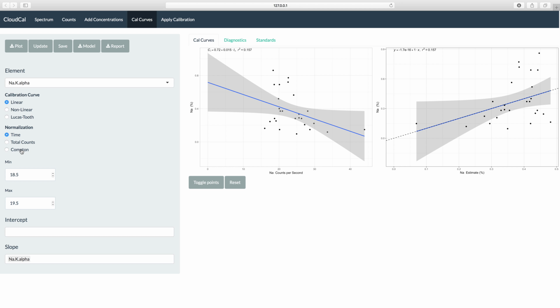And then finally, we have Compton, which is here very loosely defined as a region of the spectrum we like to normalize to. Strict physicists will lecture me, noting that the Compton peak is restricted to 18.4 to 19.5 keV with rhodium, or that it'll change based on the X-ray anode source or target. But here, it's basically a range of the spectrum. So you can use Bremsstrahlung, you can use background values, you can really use anything you want.